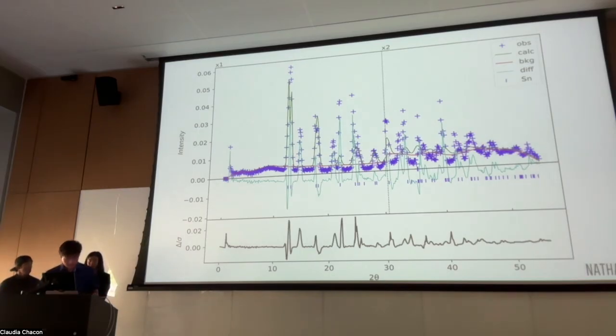So for my results, the calculated model reproduced the major diffraction peaks, indicating a reasonable structure fit. Some peaks, particularly the strongest peak around 13 degrees, do not perfectly match the experimental intensity. So the residual plot also shows subregions around it that can be improved.